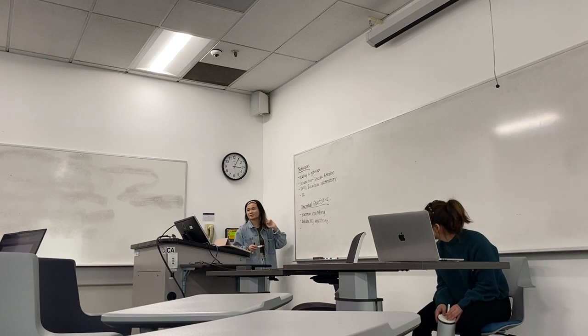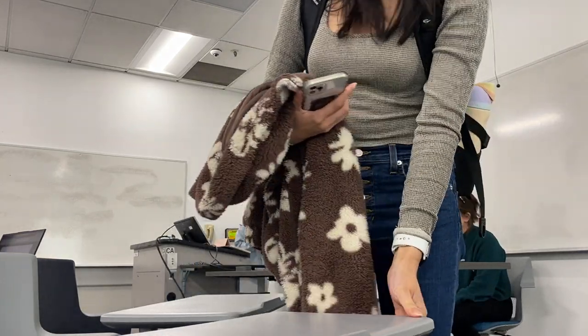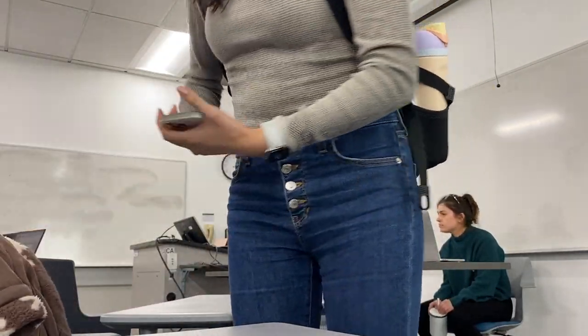I didn't finish this, but we'll just start with the techniques and then we'll go. And if you guys have any questions, you can raise your hand and ask both of us. Yeah? The glove box, so get to know how to use it.